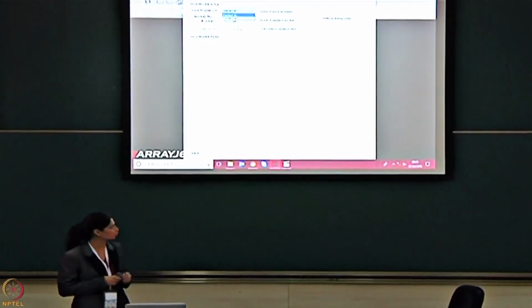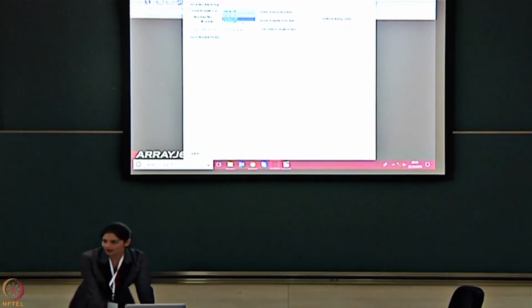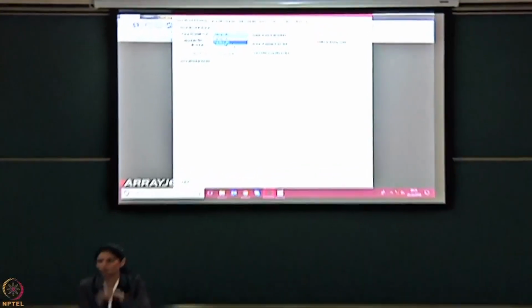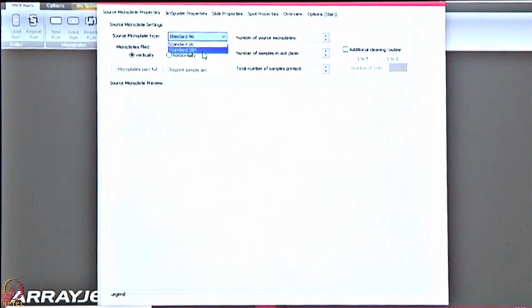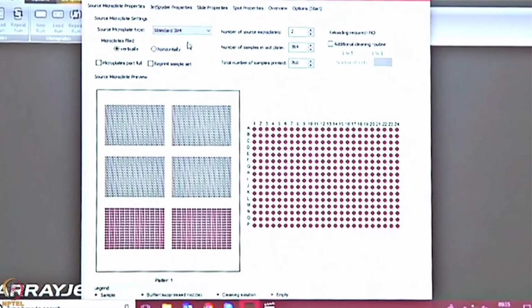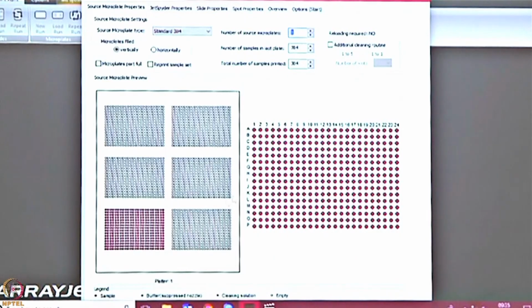22. Okay. So that's a good number because it can do 12 times 12. So what will happen is 2 of that will be blocked. So we can design a 22 sample run very easily, and I'll show you how. So obviously most of us use a 384 well sample plate. I'm going to reduce this to 1. This is your 384 samples.